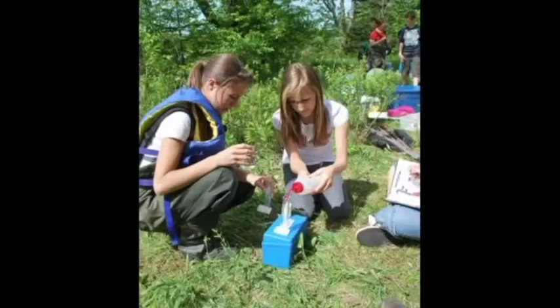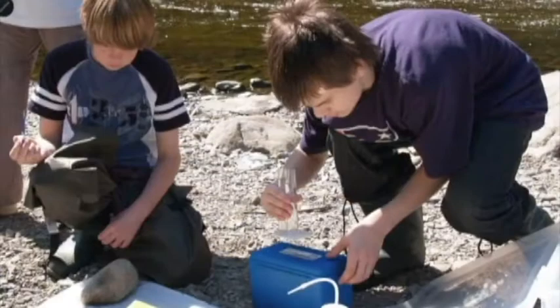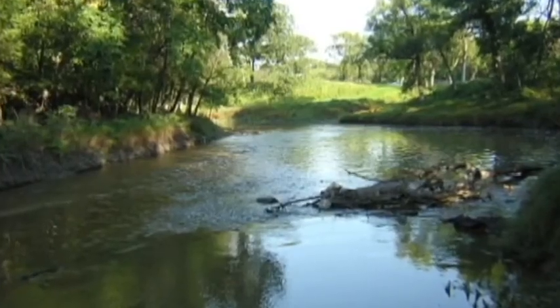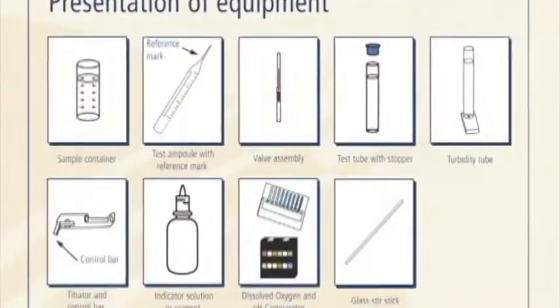However, if it is appropriate to measure other parameters, such as phosphates, nitrates, and suspended solids in your region, don't hesitate to analyze them too. You can interpret your results using information on the physicochemical reference chart and in the program guide.